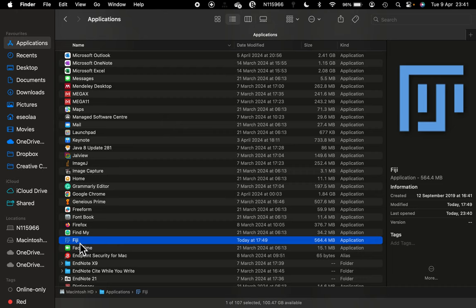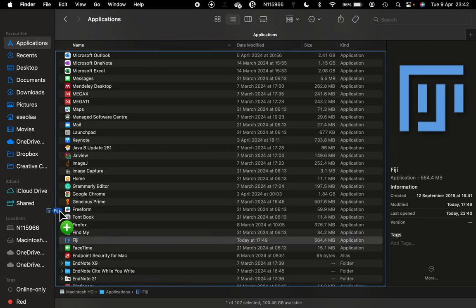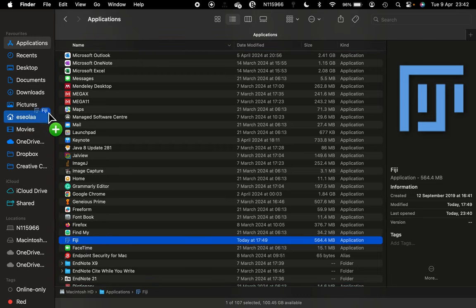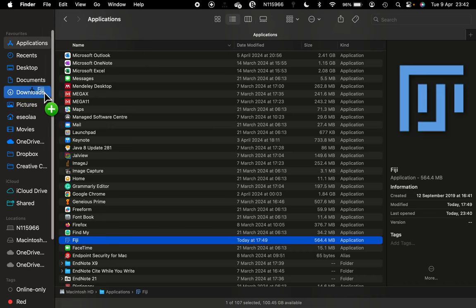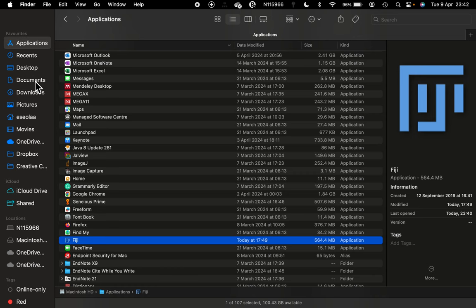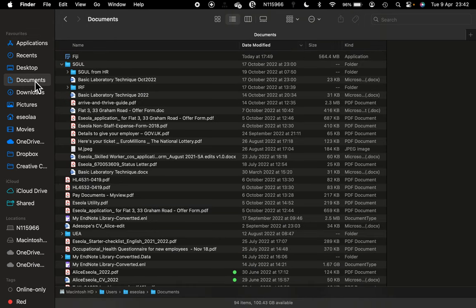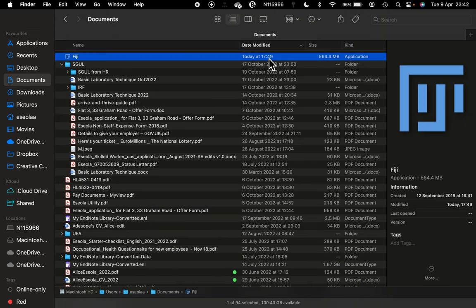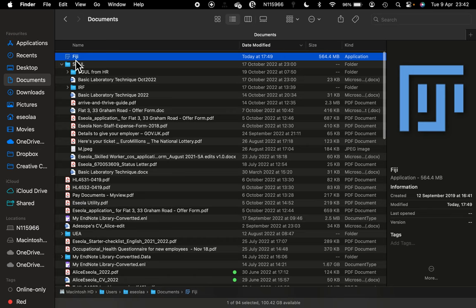If you are using Windows, you need to click on the alternate key on your keyboard. Click on that and then drag that software into a new file location. I'm copying this into my documents folder. As you can see, I've now moved my Fiji into my documents folder. From there is where I'm going to open my Fiji.